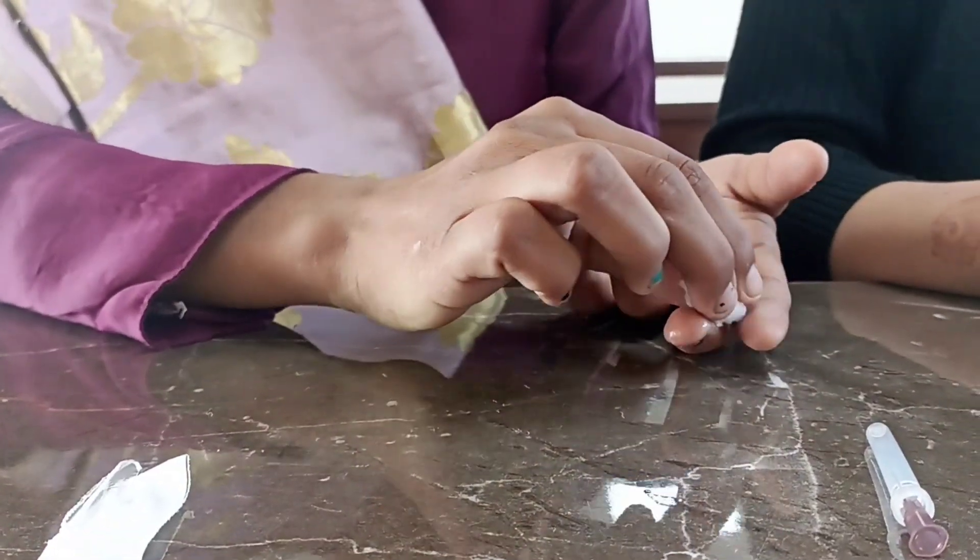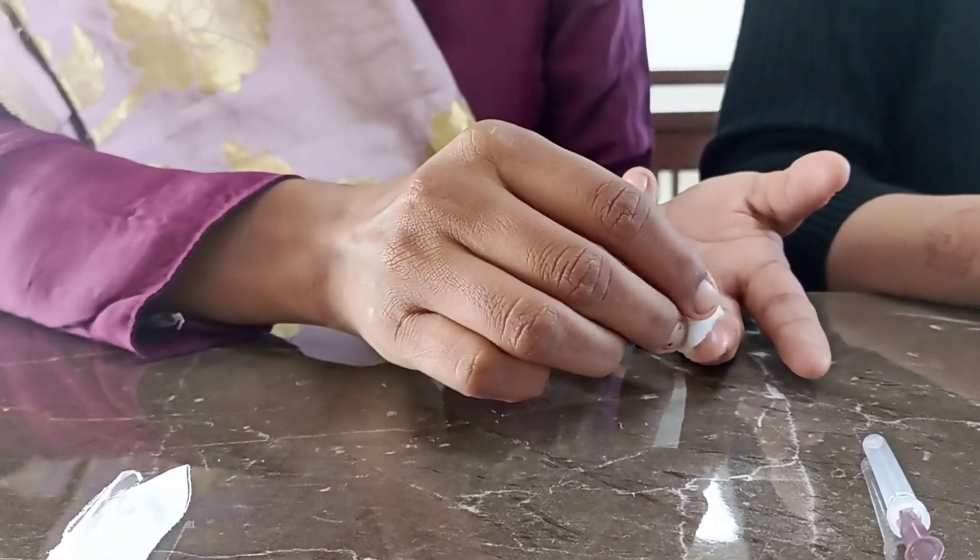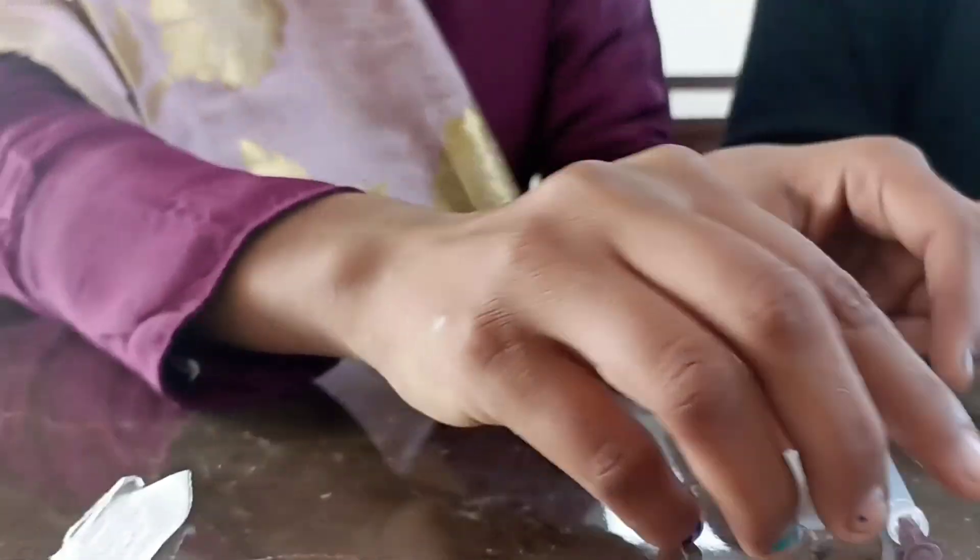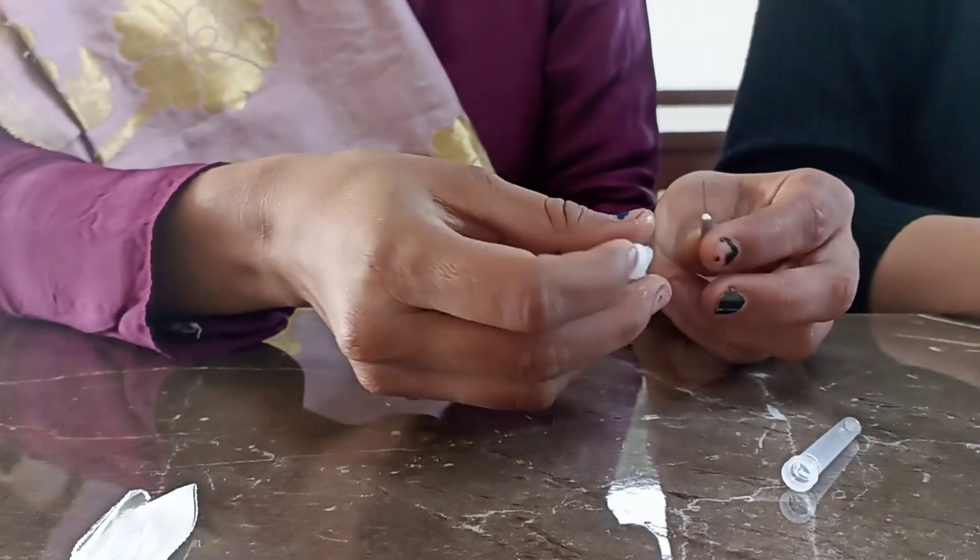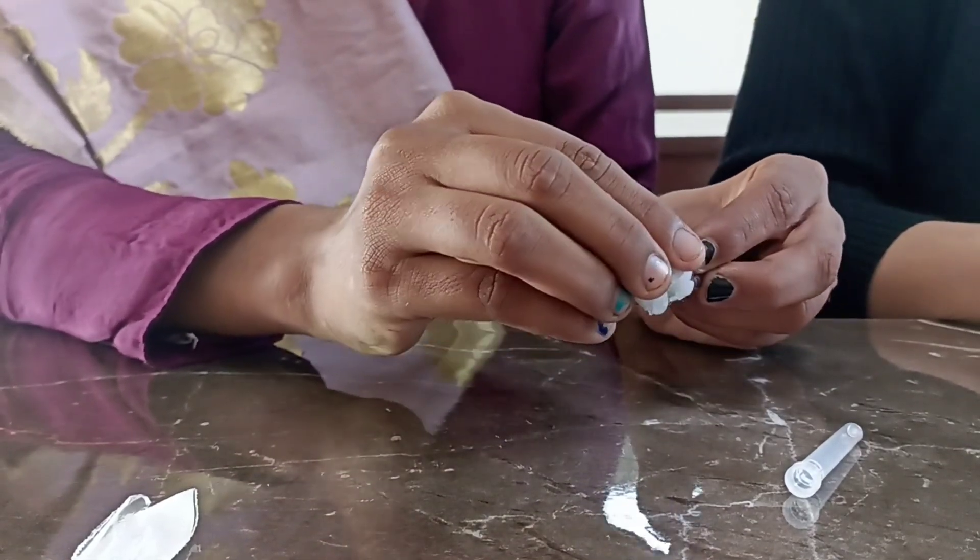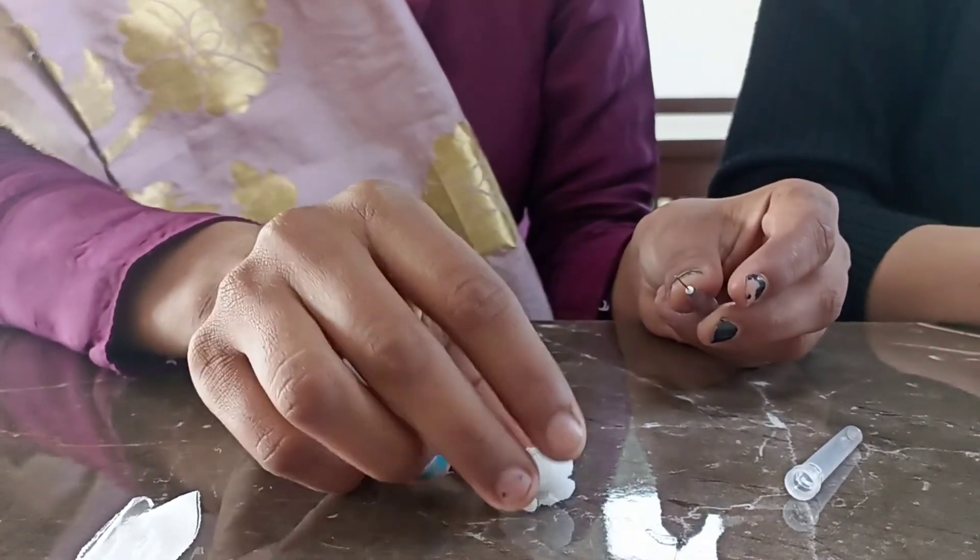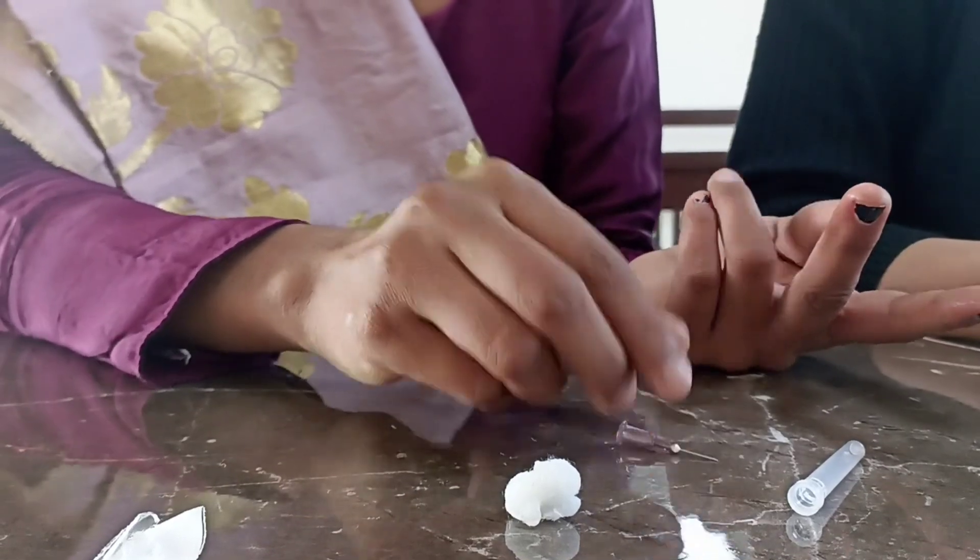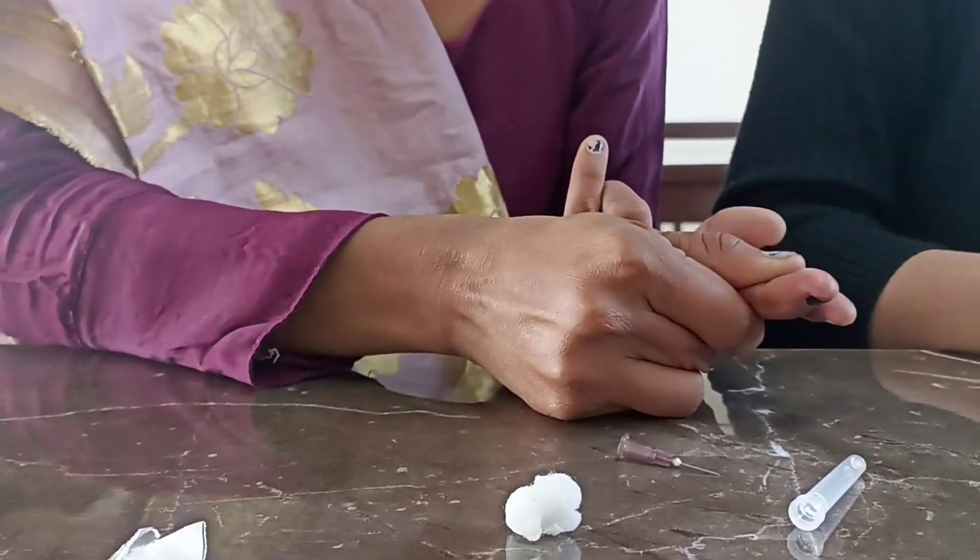Now, sterilize your middle finger with 90% alcohol. Take the pricking needle and clean it with 90% alcohol. Now prepare your finger for pricking by pressing along it.